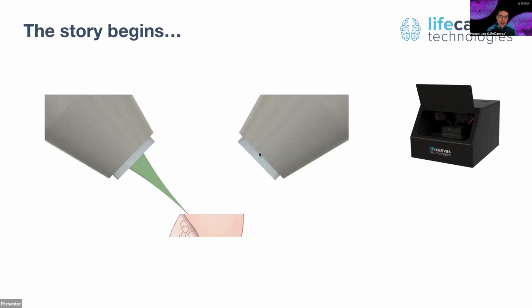To prevent any aberrations from air to immersion, we have to cover the entire light path, from the terminal optics to the sample and back to the detection, with immersion oil. But this design limits scalability because, first of all, you need a very customized sample holder, and also it's hard to swap the sample easily.